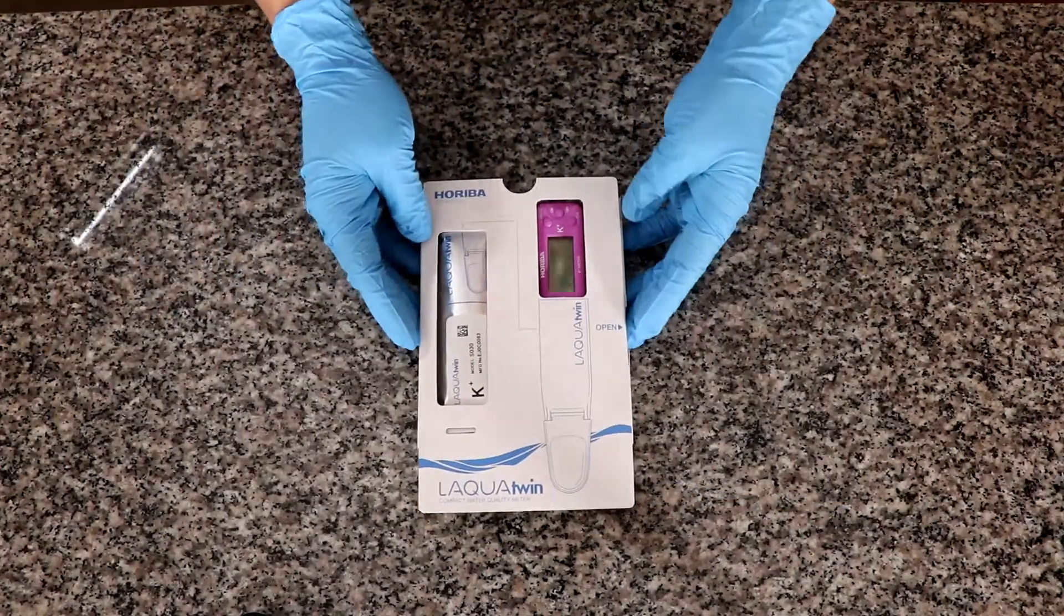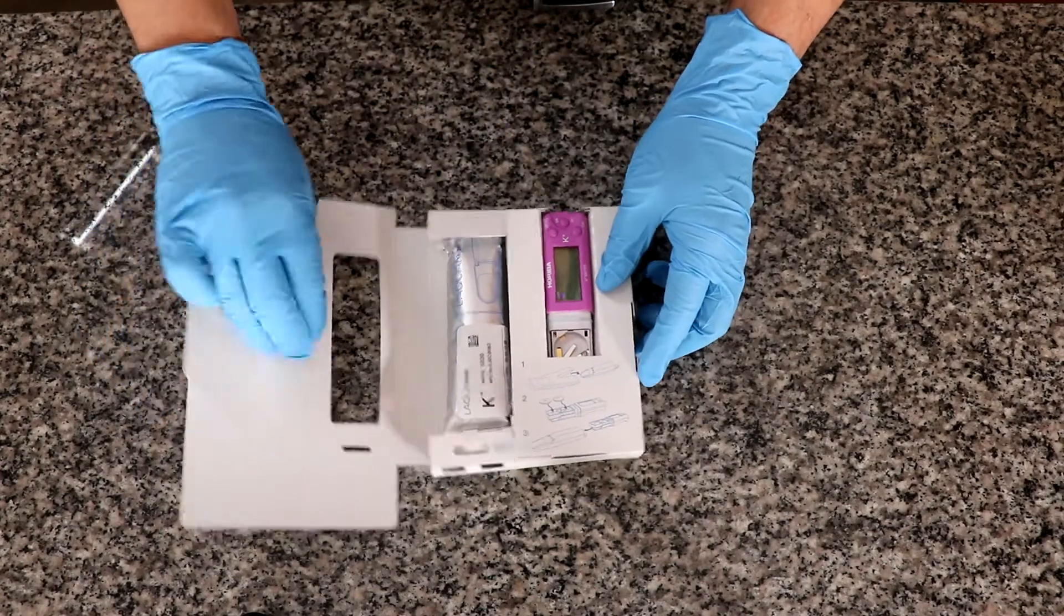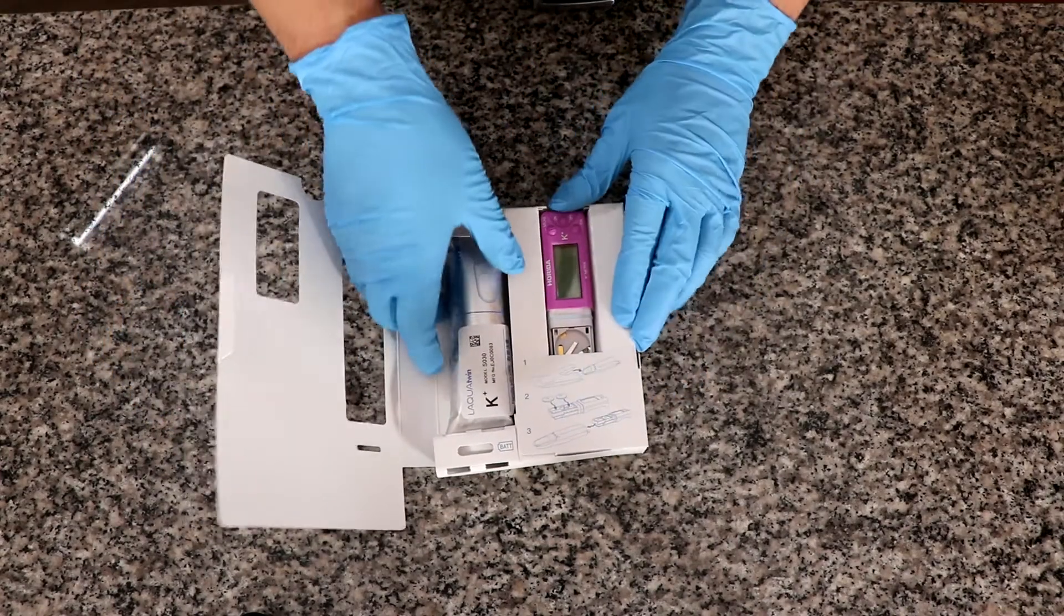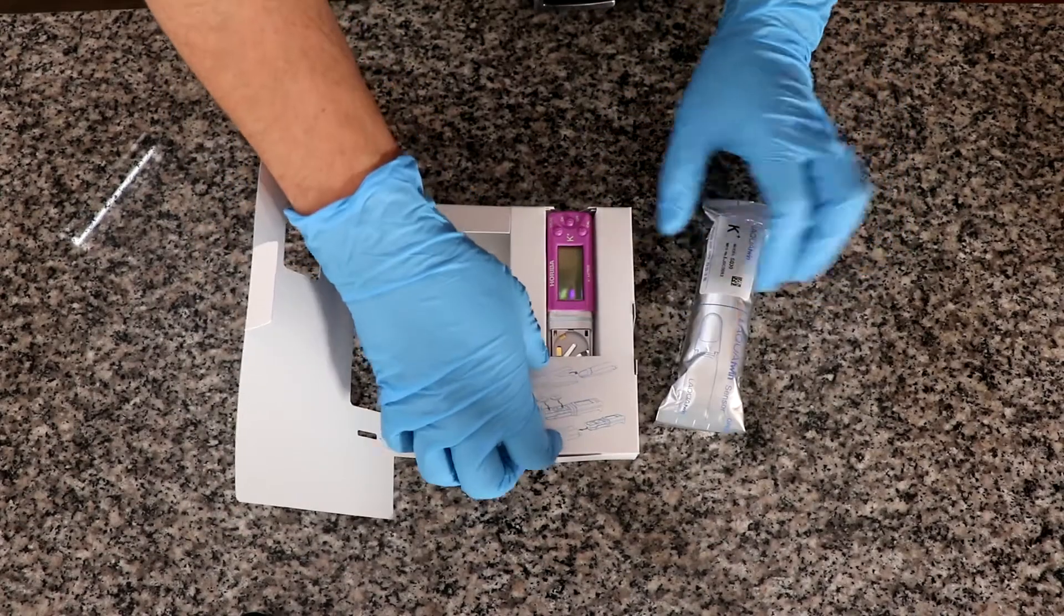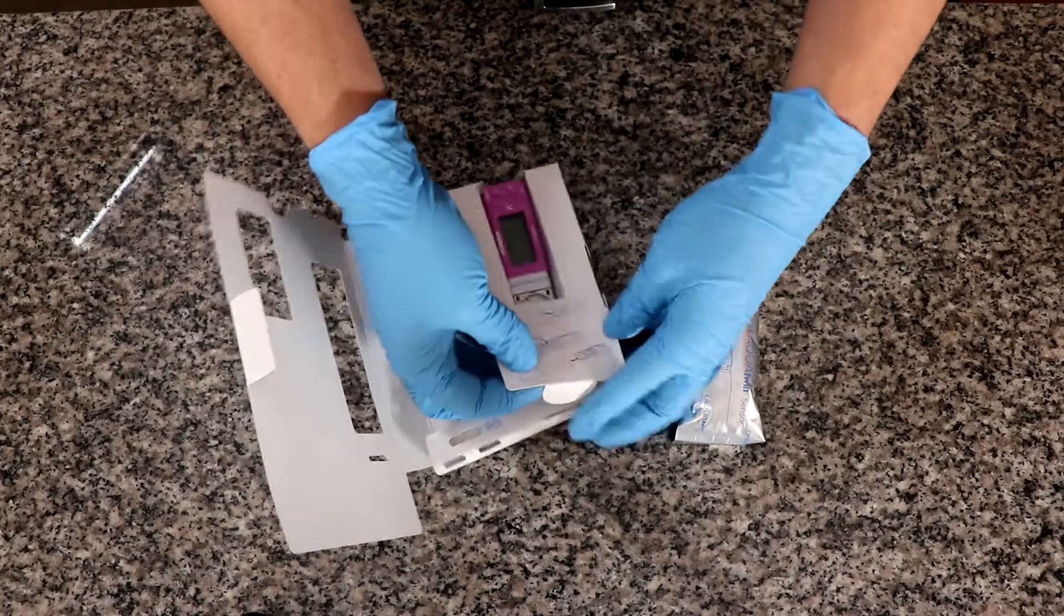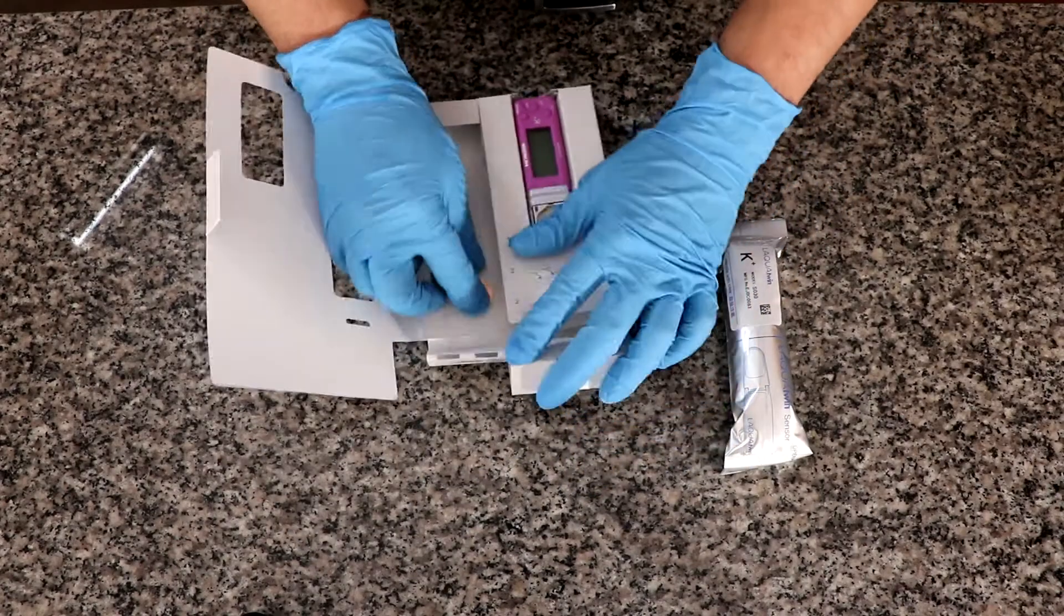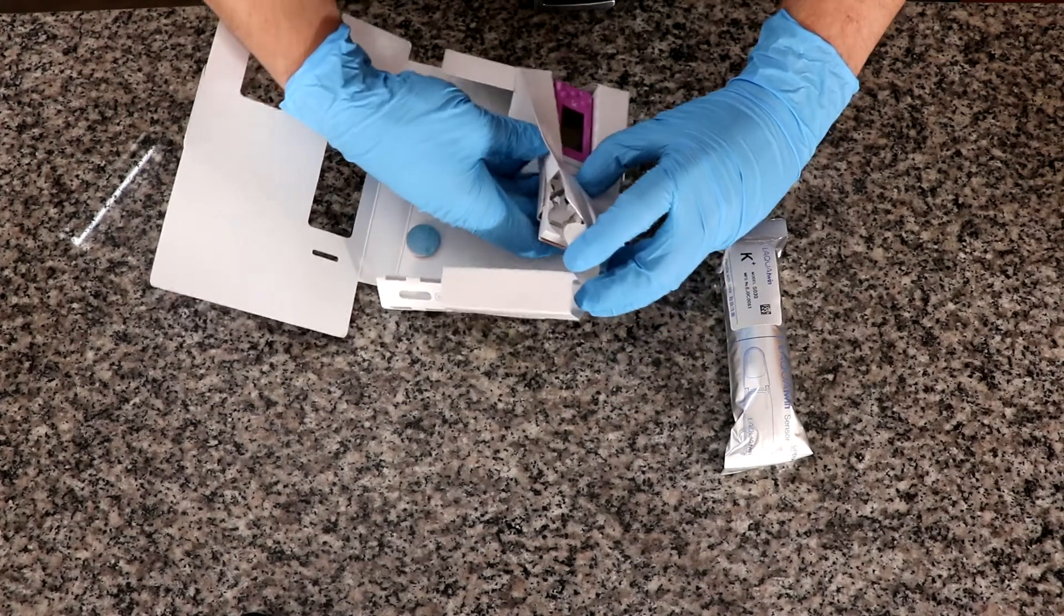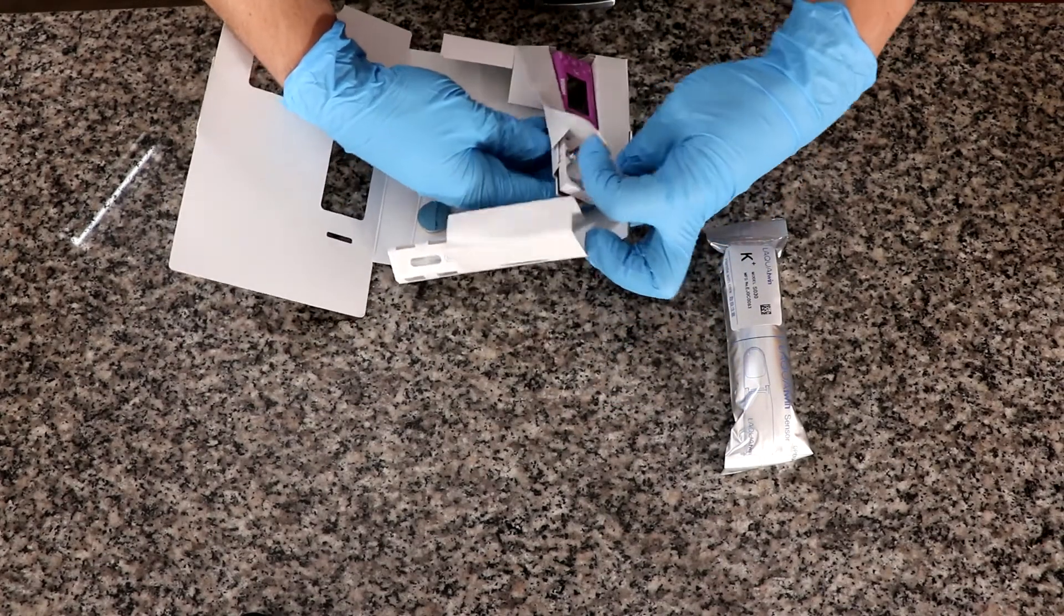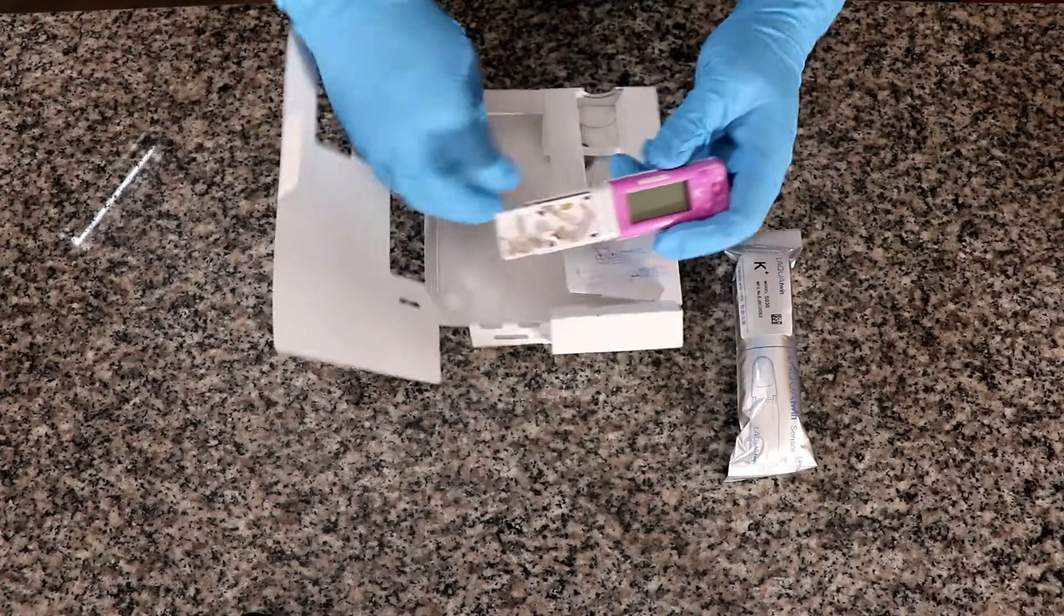Now let's perform the actual assembly of the electrode. So once you open this box you see here the instructions so we have the electrode assembly. Inside this box we have the two batteries and we have the electronic unit.